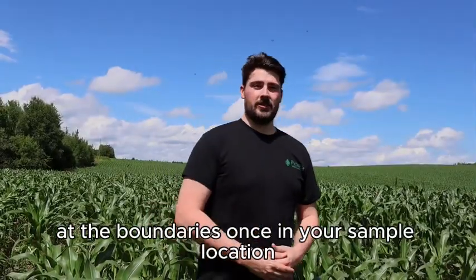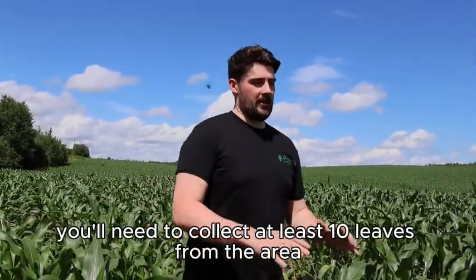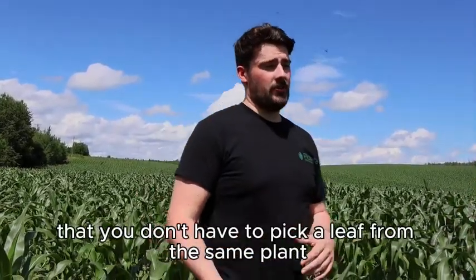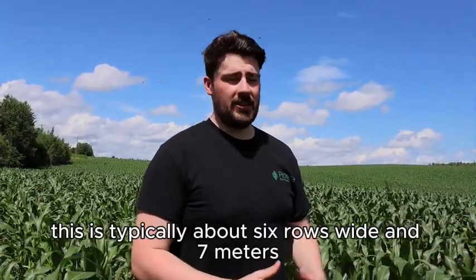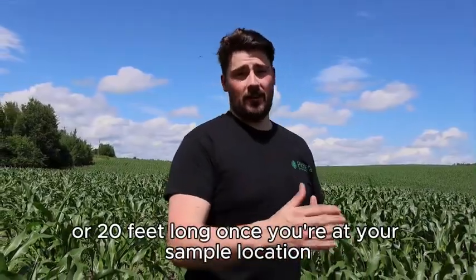Once in your sample location, you'll need to collect at least 10 leaves from the area. A good rule of thumb is your sample location should be large enough that you don't have to pick a leaf from the same plant twice during the season. This is typically about 6 rows wide and 7 meters or 20 feet long.